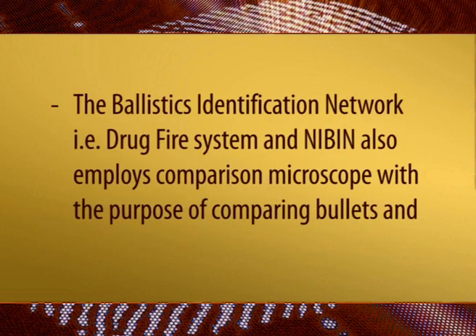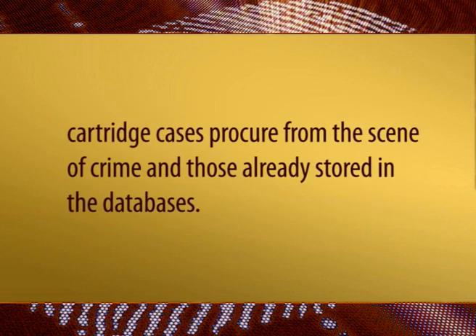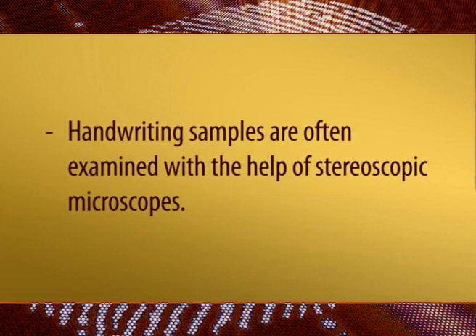The ballistics identification network, that is the DRUGFIRE system, and NIBIN also employs comparison microscope with the purpose of comparing bullets and cartridge cases procured from the scene of crime and those already stored in the databases. Handwriting samples are often examined with the help of stereoscopic microscopes.